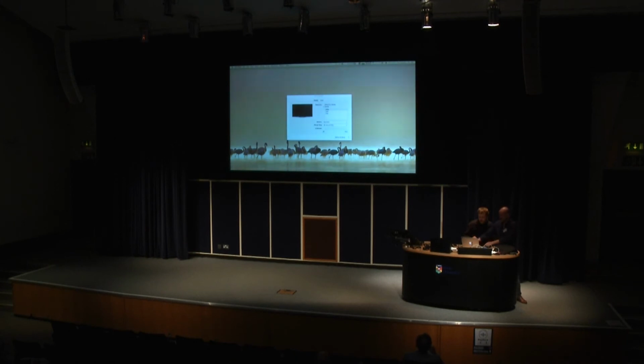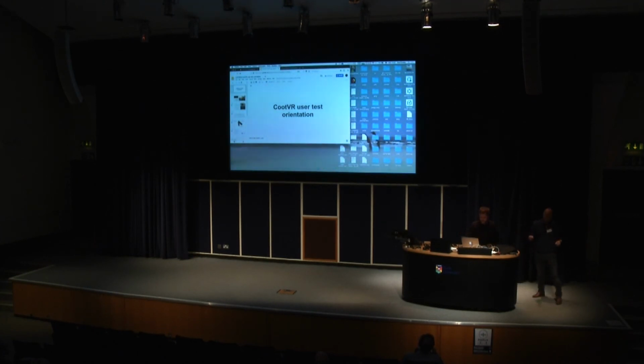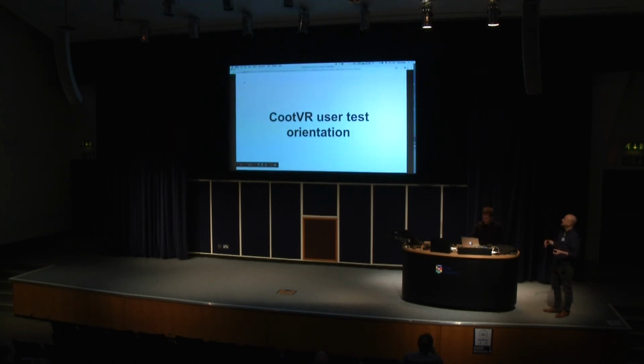Okay. Right, so what... Oh, I've gone off. Ha, hello, again. So what we're going to do now is have Hamish speak about how to use the preferences so that I can show you the displays. And after that, he'll talk about how to set up the interaction of Coot VR.